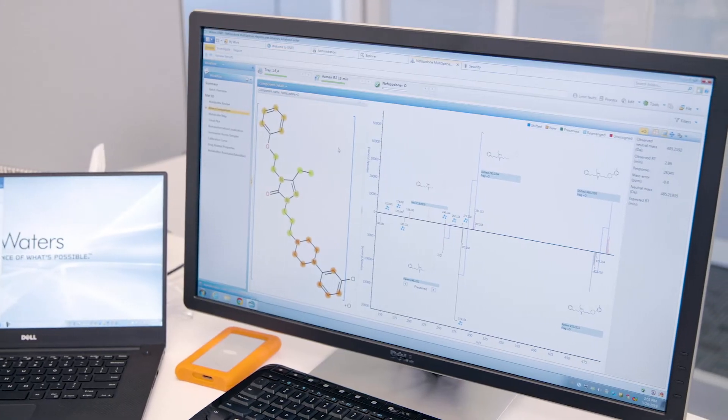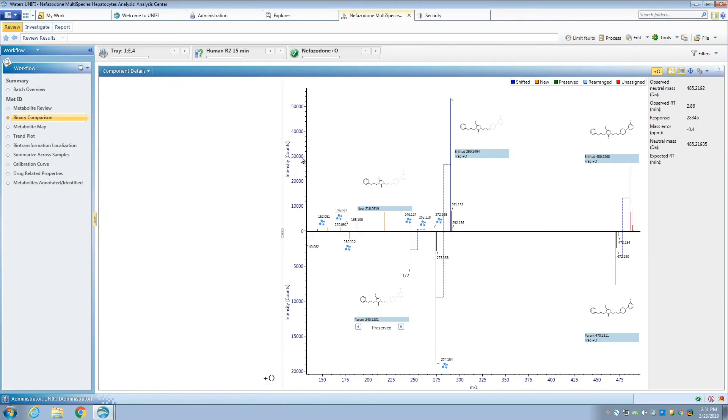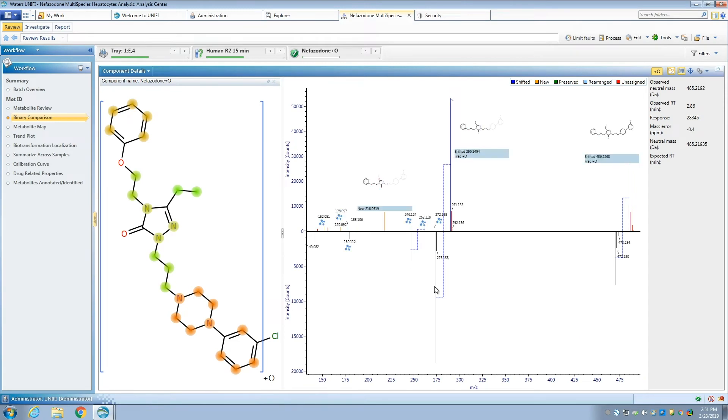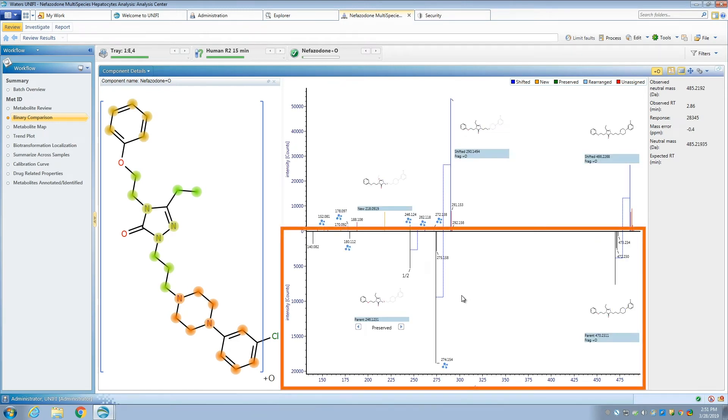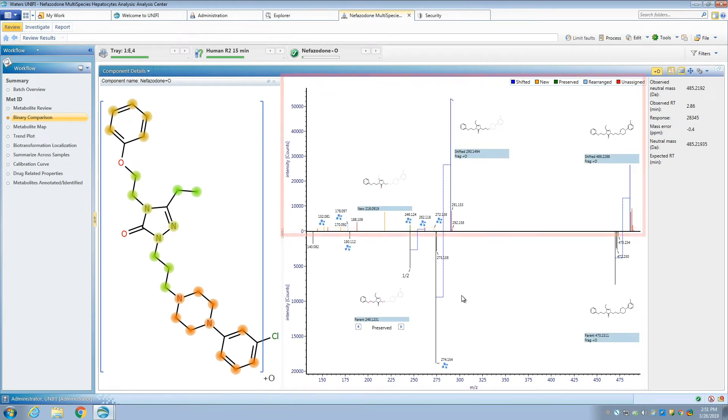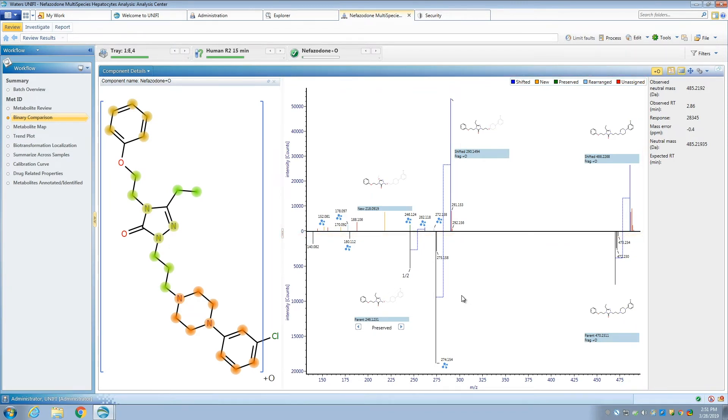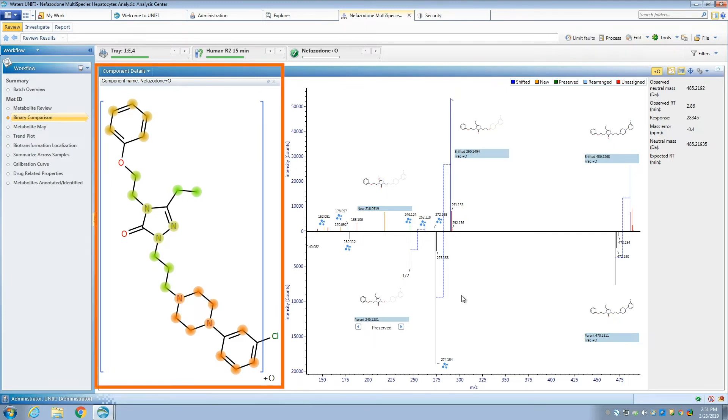Once you've done a quick review, you can look at your metabolites using the biotransformation localization workflow step. The bottom panel shows the parent spectrum along with major identified fragments. The top spectrum shows us the currently selected metabolite. If we look at a few peaks, we can see that for an oxidative metabolite, the peaks are linked with the parent molecule for each fragment of interest. This information is mapped to the structure on the left, showing the hotspot localized to the core triazolone region.